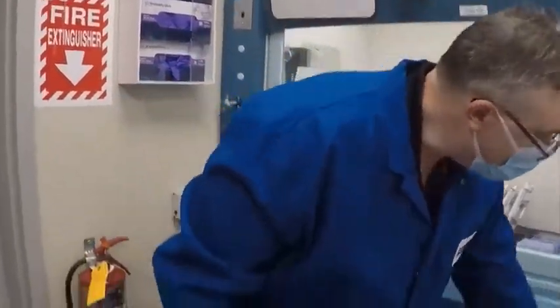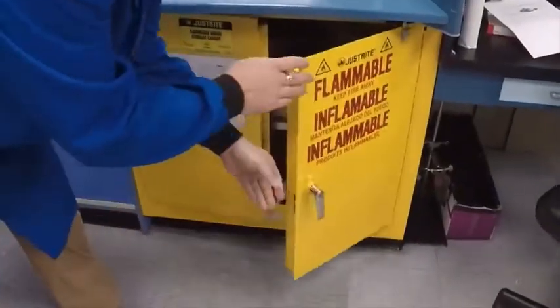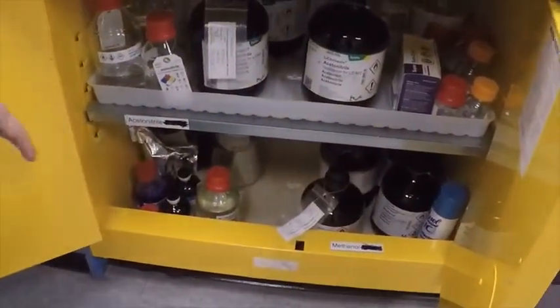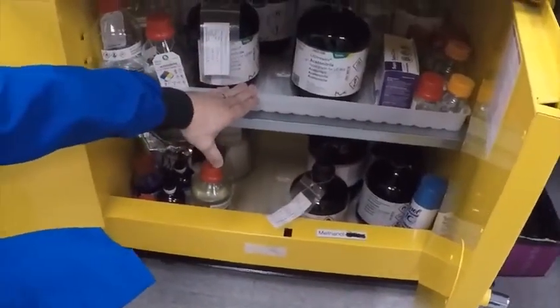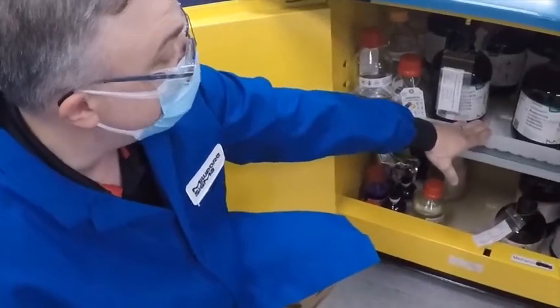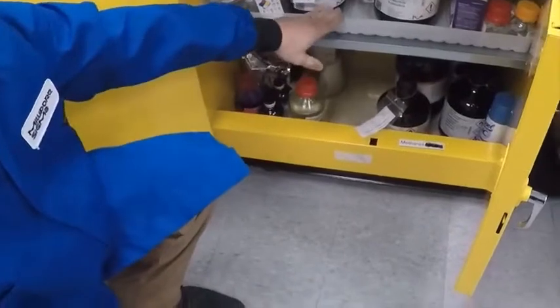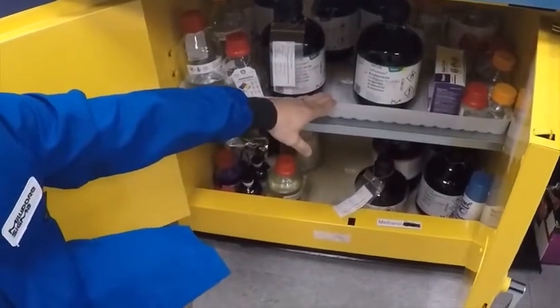Now I'd like to talk about proper chemical storage. All chemicals need to be stored in the correct cabinets. A flammable cabinet is for your flammable materials — solvents, alcohols, and other flammable materials. Flammable cabinets all need to have secondary containment so that if a spill occurs inside the cabinet, the material is contained. All materials need to be labeled properly so there is no question about what is inside your flammable cabinet.